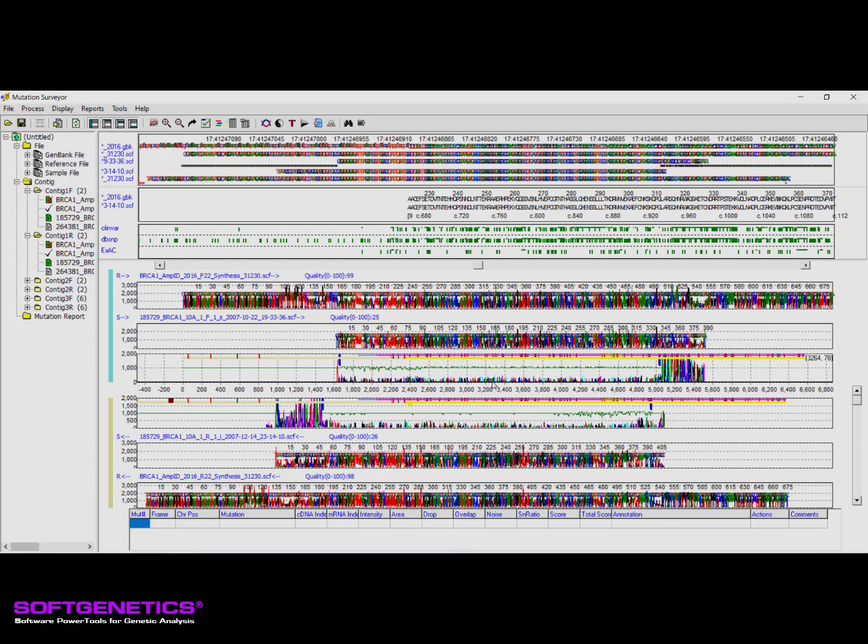If the loaded GenBank or SEQ file includes variant information, these will be displayed as tick marks in the mutation trace, with the color representing the nucleotide substitution type. To learn more about using this pane for the editing process, please continue to watch Part 3 of this webinar series.